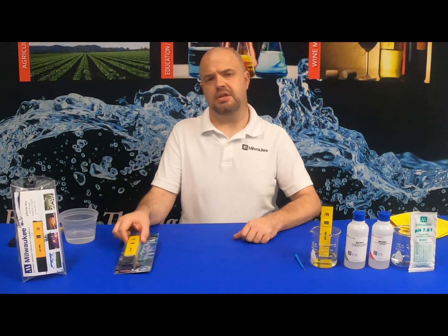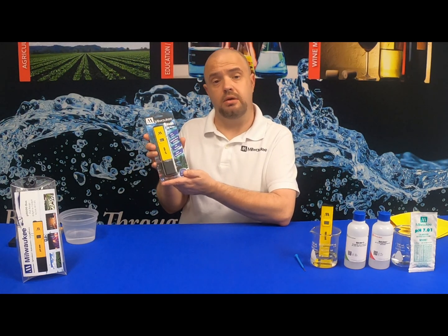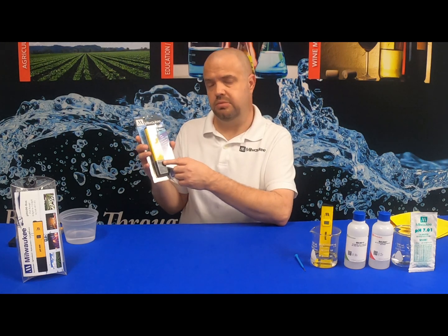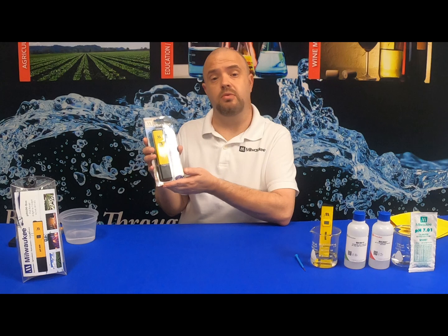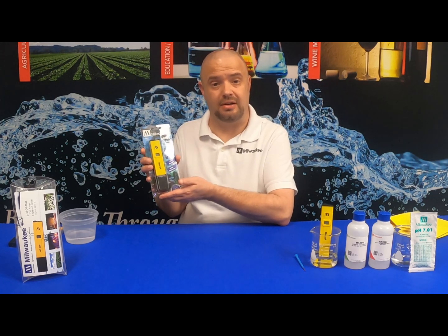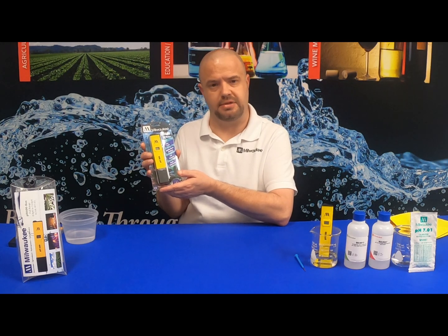When you receive your Milwaukee Instruments PH600 pocket tester, you may notice some crystallization between the cap and the unit itself. There is nothing wrong with the unit — it is not defective. Let me show you how to properly remove the crystallization from the PH600.